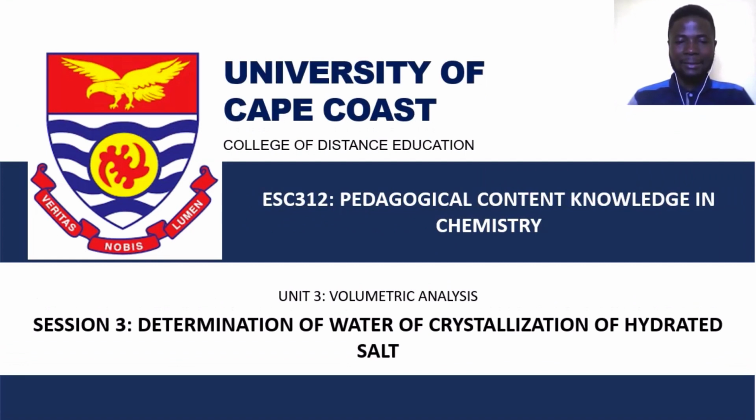This session is going to look at how to determine the water of crystallization of a hydrated salt. Without wasting much time, let's get started by looking at the objective for this session.